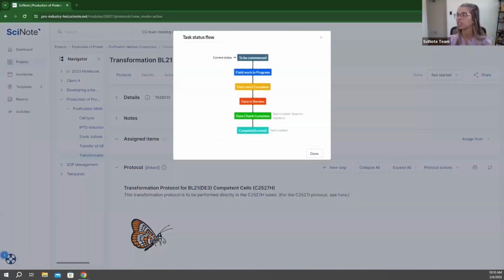when the task reached complete lock status, let's go in here to our complete lock status, you could have users who have the role supervisor on that project containing the task receive e-signatures. Or let's say maybe when the task reaches data check complete, you could have a role that might be for the PI, and that role could review this and have signature requests before processing forward.